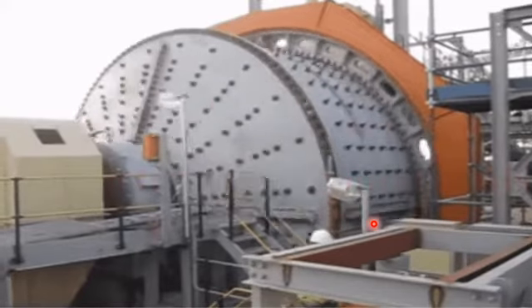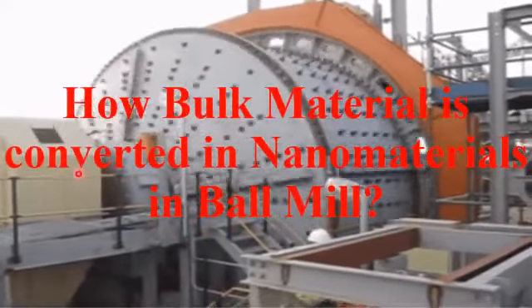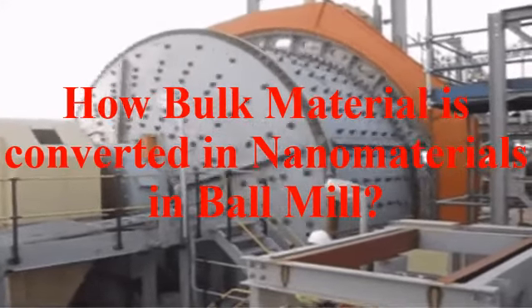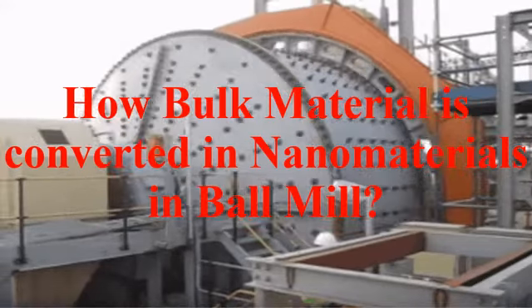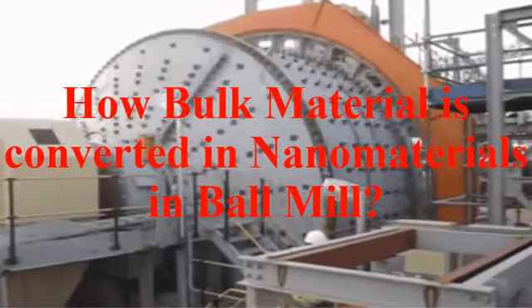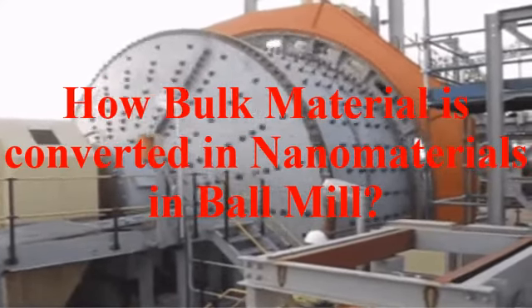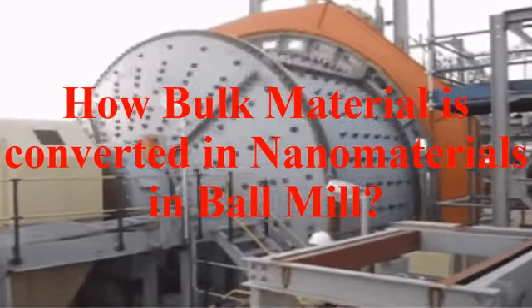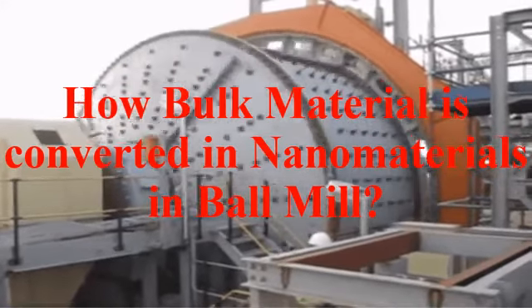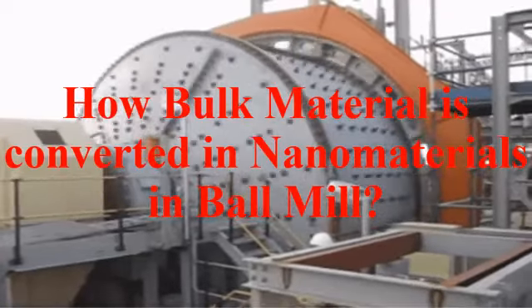Now student, what do you think, how is a bulk material converted into a nanomaterial in ball milling? This must be the first question in your mind: how is the ball milling technique used to convert a bulk material into a very fine, small nano powder or nanoparticle or nanomaterial?